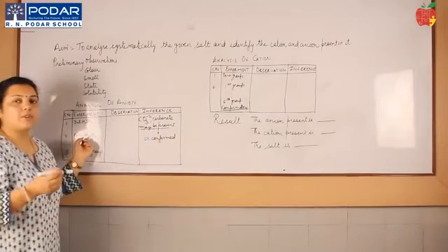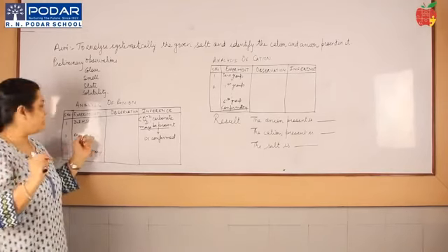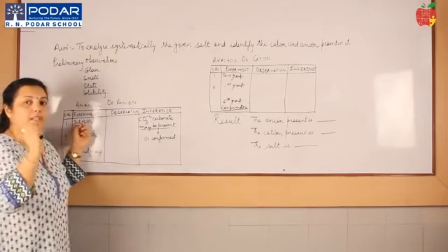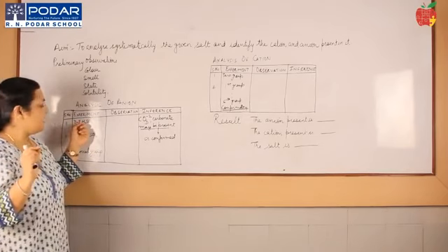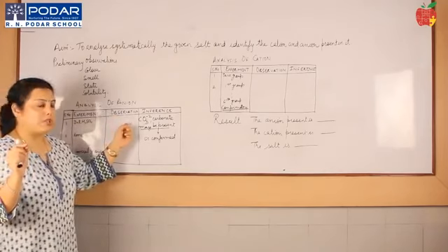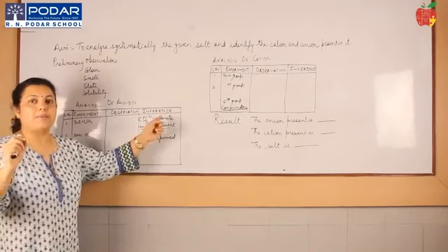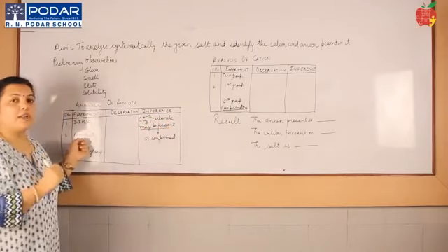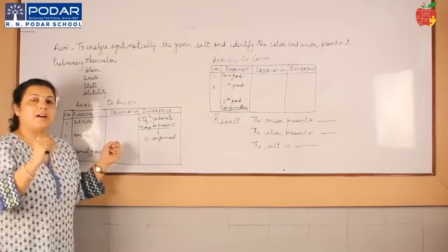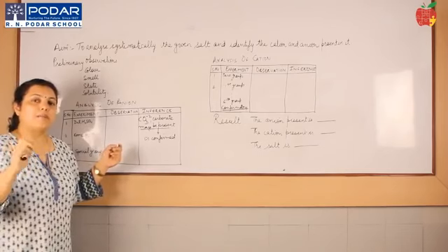Okay, now suppose I'm talking about the concentrated sulfuric acid group. Carbonate is not there, let's assume chloride is there. Then what you will do is, negative tests are equally important. That means you will always start writing with the dilute H2SO4 group. You will say to a pinch of salt, dilute sulfuric acid is added. Then you will say no observation, carbonate, sulfide, nitrite absent. Then you will say over here to a pinch of salt, concentrated sulfuric acid is added. For the chloride, the observation is a colorless gas with pungent smell is evolved, which gives dense white fumes with a rod dipped in ammonium hydroxide.